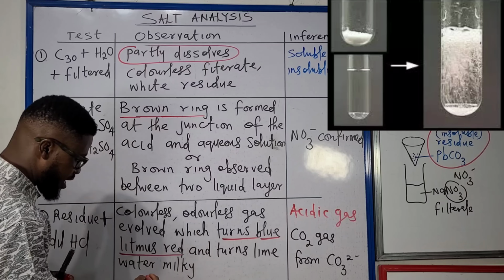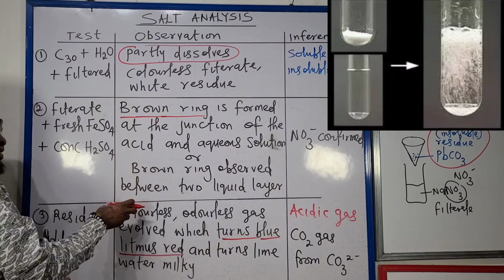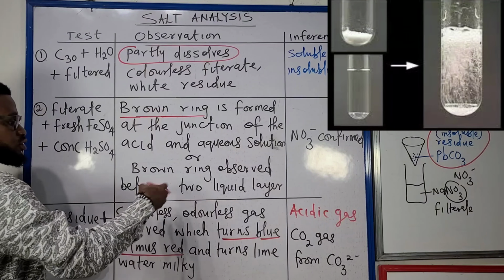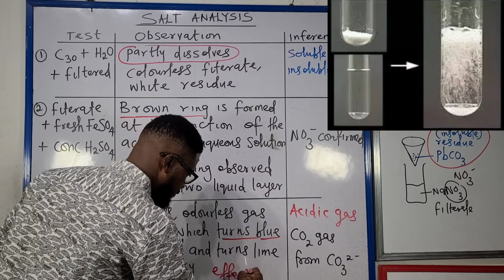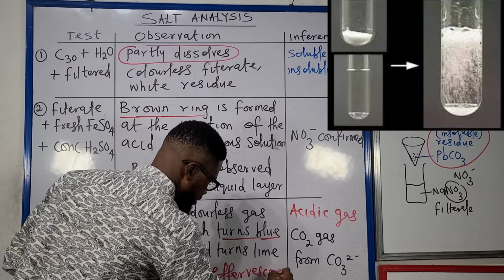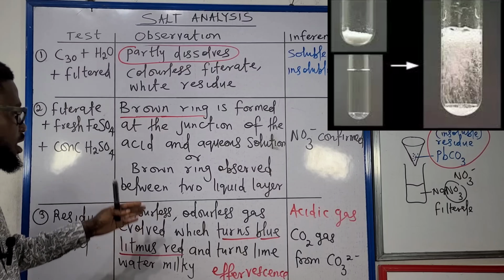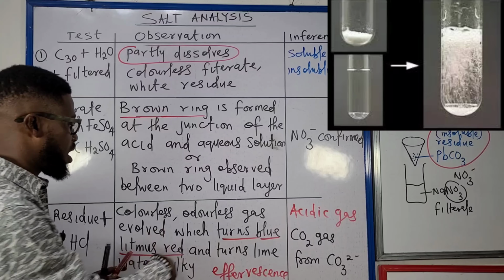might occur here. Effervescence. Okay, so you may want to add that to this, that effervescence occurs and a colorless, odorless gas is evolved. I think you should put that first. That's talking about effervescence here.